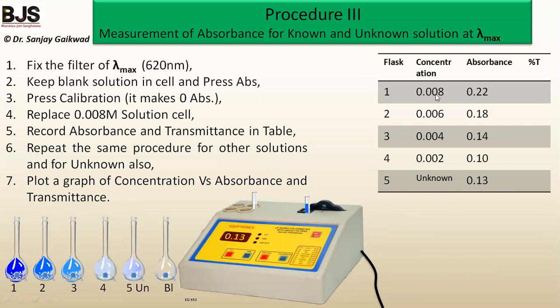The recorded absorbance values are: 0.08 M → 0.22, 0.06 M → 0.18, 0.04 M → 0.14, 0.02 M → 0.10, and unknown → 0.13. After measuring absorbance, pressing the transmittance button on the same solution immediately gives the percentage transmittance. Transmittance values are recorded for all known concentrations and the unknown solution in the same manner.